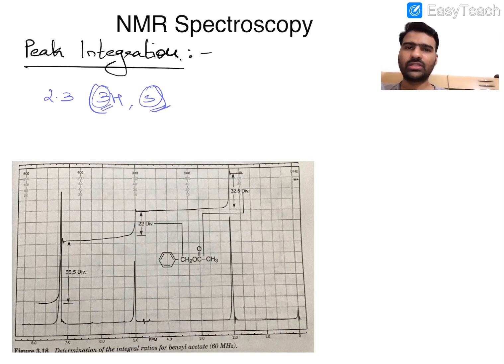And therefore, I encourage you to go to certain characteristic problems concerning NMR, and you would see that this number of nuclei is always specified for H1 because H1 spectrum is completely integrable, and therefore you will be able to make out for each and every signal that has originated in the NMR spectrum is contributed by how many nuclei of the proton type. However, this particular information will never be available to you for C13 spectra, because C13 NMRs are not integrable for reasons we will come to ahead in our discussion in NMR spectroscopy.